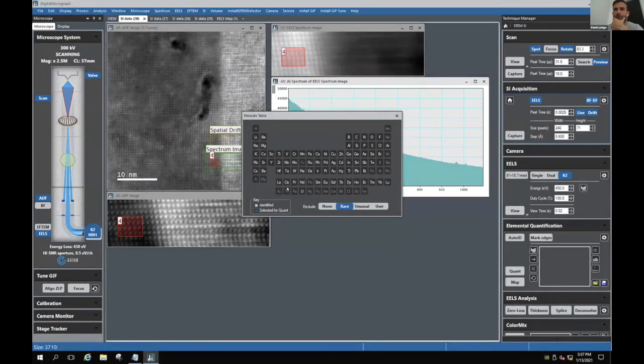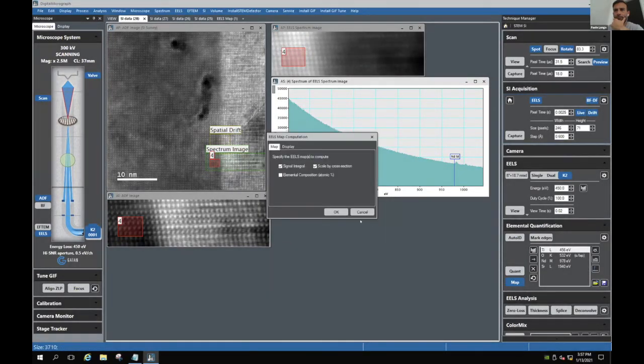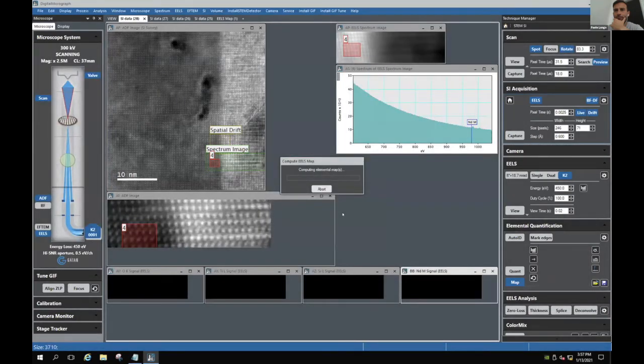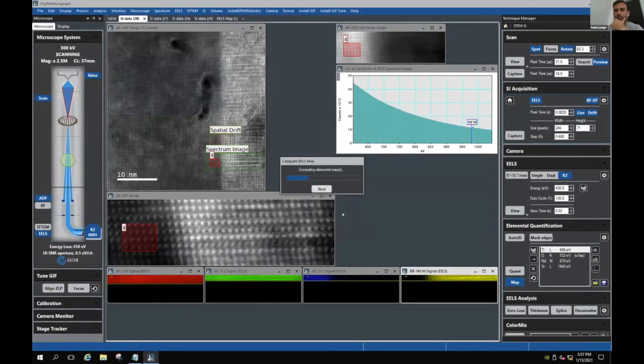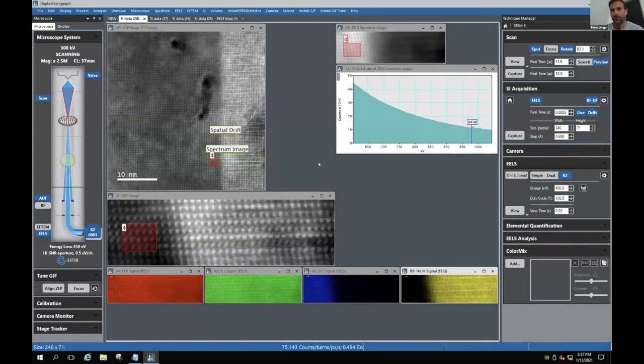Actually, we also have the strontium in there. You see, by the reference image, there is still decent signal at least there. You're still getting pretty good maps here. Yeah, you can see the area where there is more neodymium is more intense than the other one. That's just to give you a quick idea.